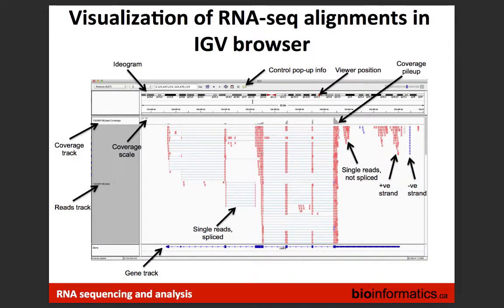One way to visualize a BAM file is IGV. You can view the chromosome of interest — for example chromosome 3 — and see piled-up reads. The gene annotation track shows exons as islands connected by lines representing intronic regions. You expect to see reads piling up on exons and not on introns, unless there is a novel unannotated exon discovered in your dataset.